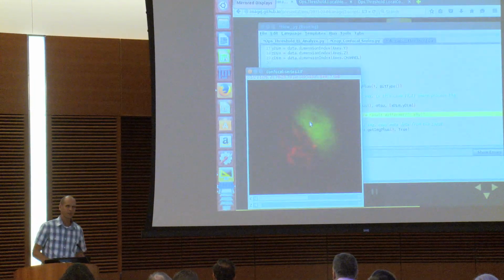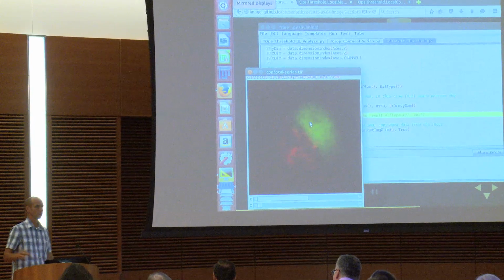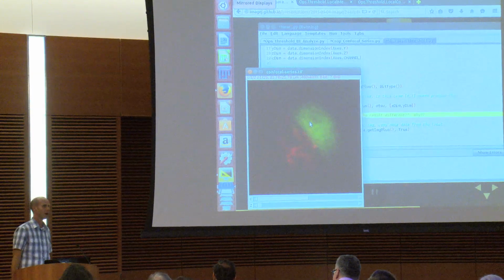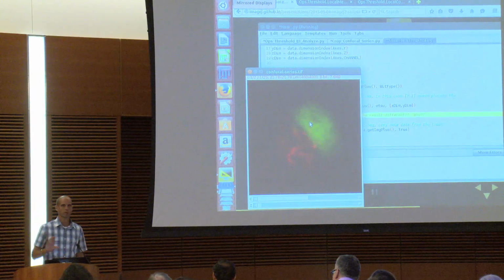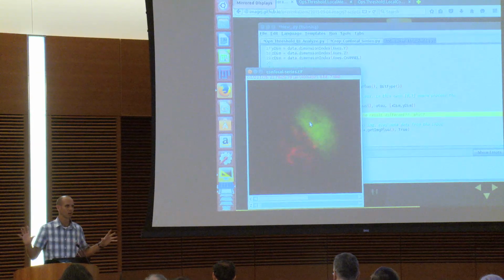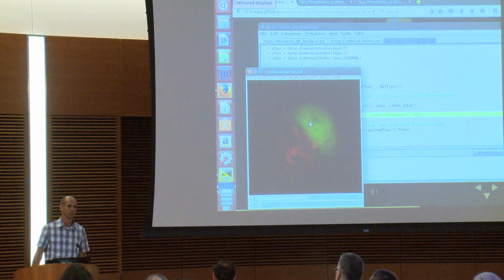So again, it took me a long time to grasp all these concepts and get more comfortable with the APIs. All these examples are actually in two places. They're obviously in the tutorials and they're embedded into the presentation. So if you want to go back and look at them after, and then ping all kinds of questions, that's the way I would have to do it. I wouldn't be able to absorb it in 2 hours.